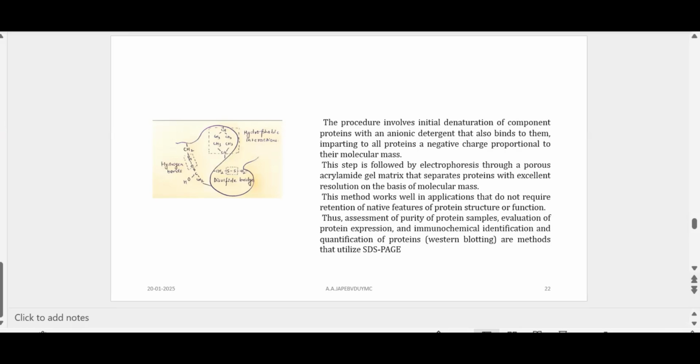So here in this case, if you talk about characterization of beta 2M oligomers, SDS-PAGE of that particular protein is done under non-reducing and reducing conditions. So oligomerization started from monomer. This is what, right? With or without DTT. That is an agent which is added to it, and then SDS-PAGE is done.